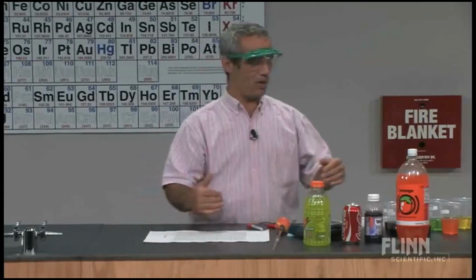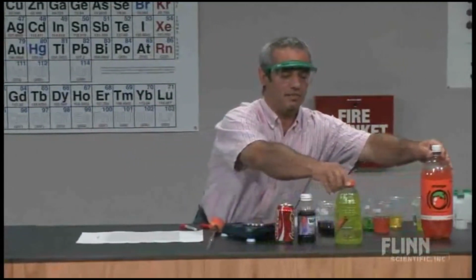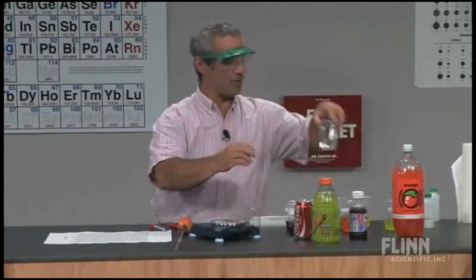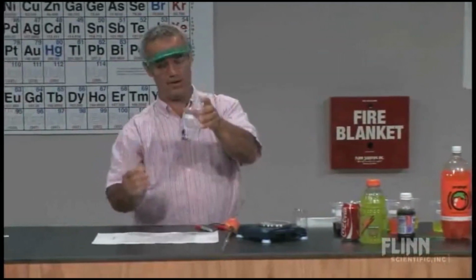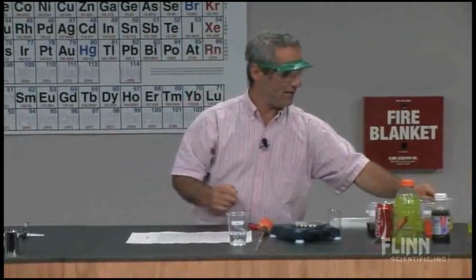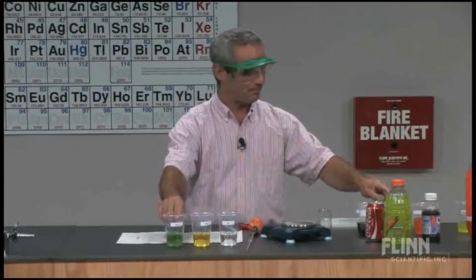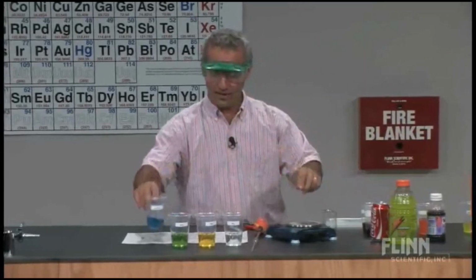density. We're going to start not with these, but with some solutions we've made up already. Some 0% sugar solution, well, that'd be water. And we've got 5%, 10%, 15, and 20. And the very first thing you notice is they're colored.